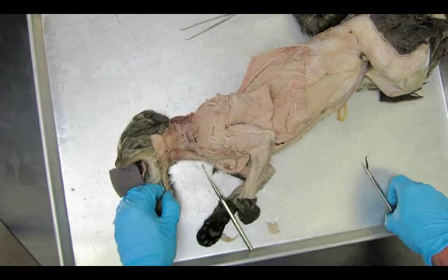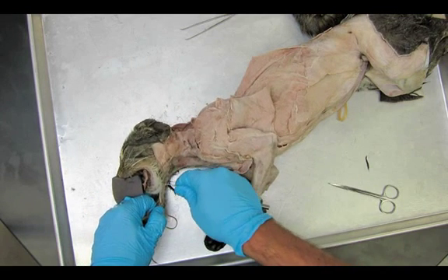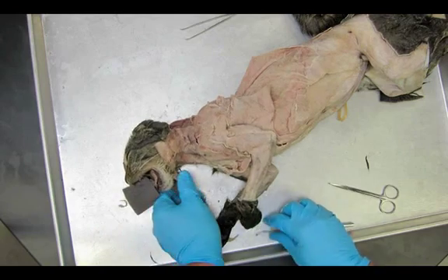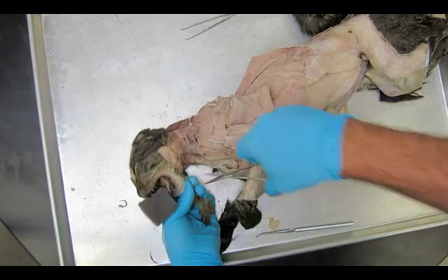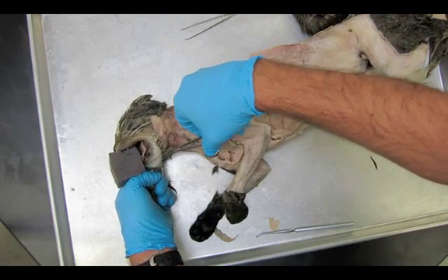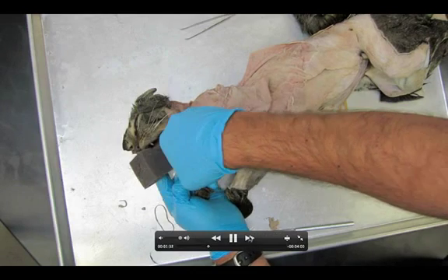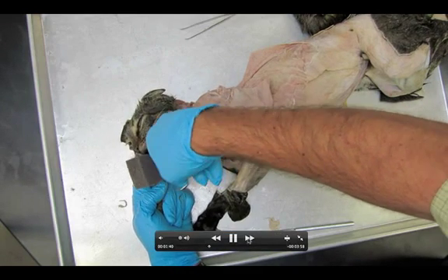You can leave that foam piece in the mouth of the cat right now, but eventually you're probably going to have to take it out as you lift the chin up. That foam piece is just there to keep the teeth from tearing holes in your bag and causing your bag to leak out all the preservative and then start to dry out. Pretty soon we're going to have all of the skin off and then I can get started on the actual dissection itself.